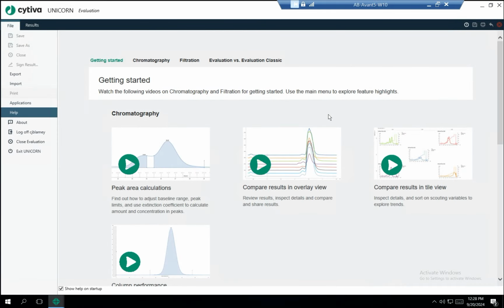Chad here. Today I want to show you how you can draw new curves by doing arithmetic. There's a variety of reasons you might want to do this, and I'll show you why by example.